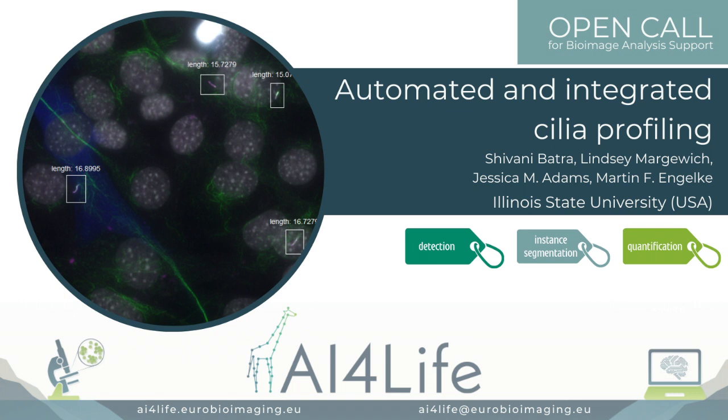So for this analysis, we used CellPose to segment both the nuclei of all of the cells and the cell bodies of the cells that were overexpressing the motor protein. We used random forest pixel classification using LabKit in Fiji to detect the cilia, again using the two markers that together identify cilia uniquely. From there, we needed to associate each cilium with the correct nucleus that belongs to the cell that houses the cilium.